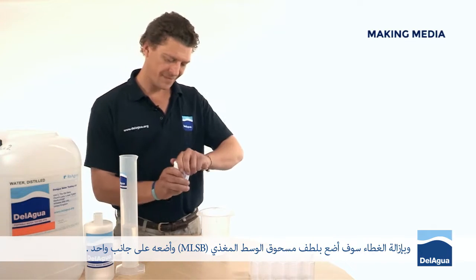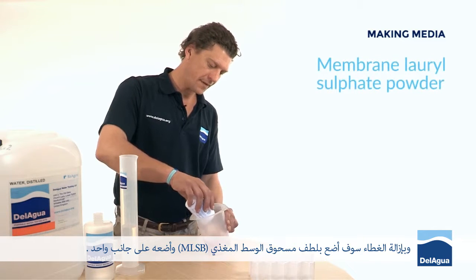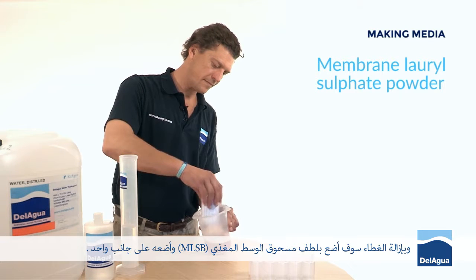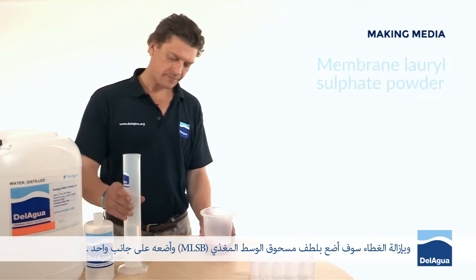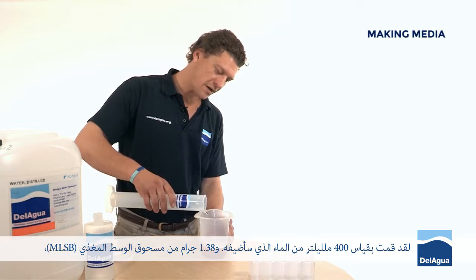Removing the seal, I'm going to gently tip in the membrane lauryl sulphate powder and place it to one side. I'd already measured 400 millilitres of water, which I'm now going to add.